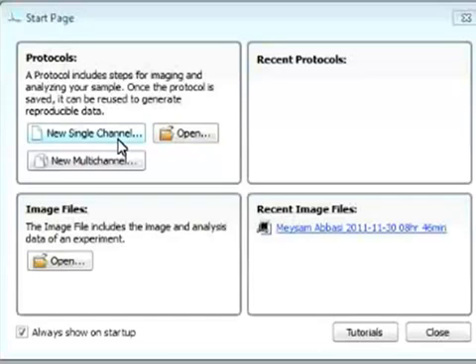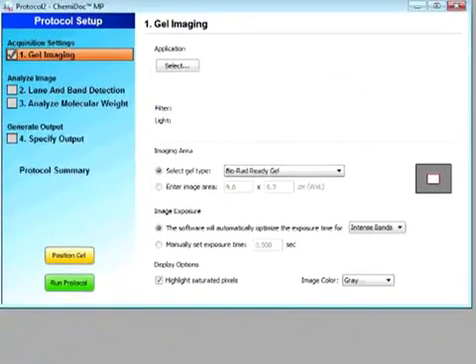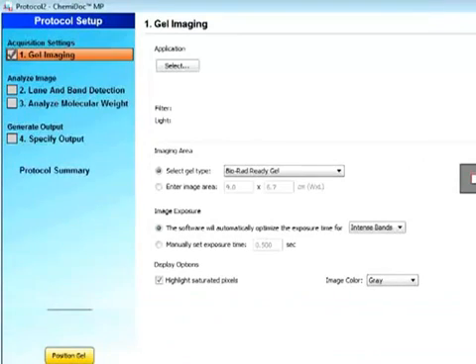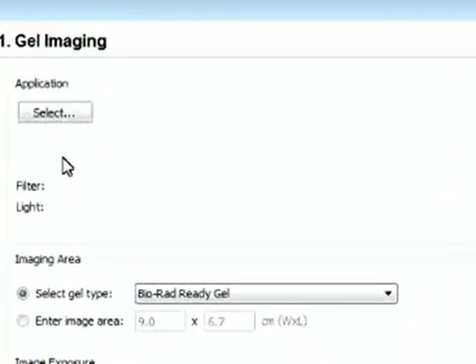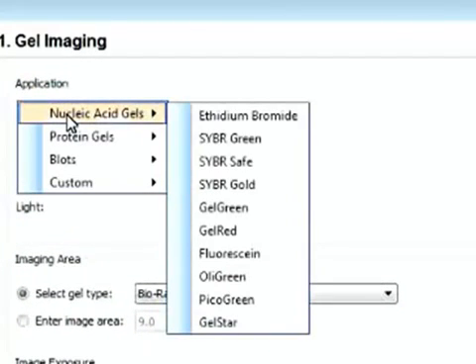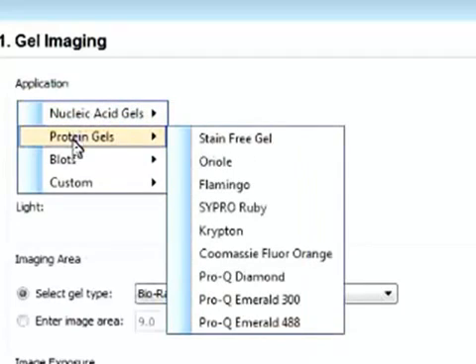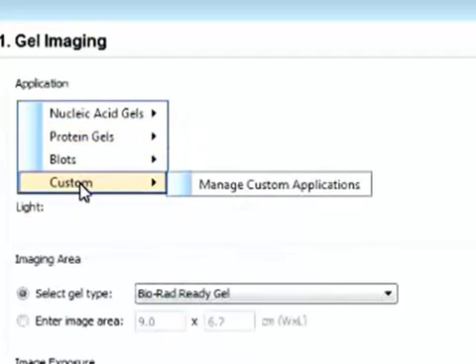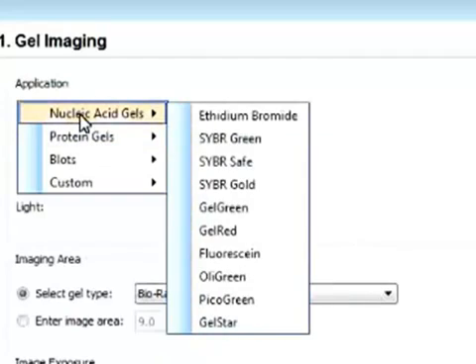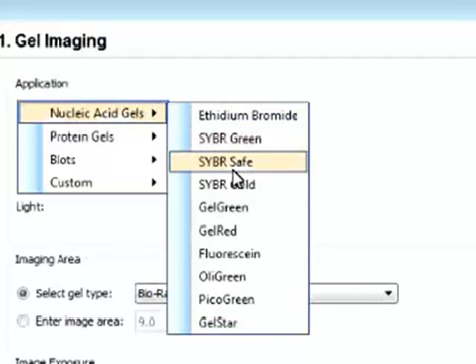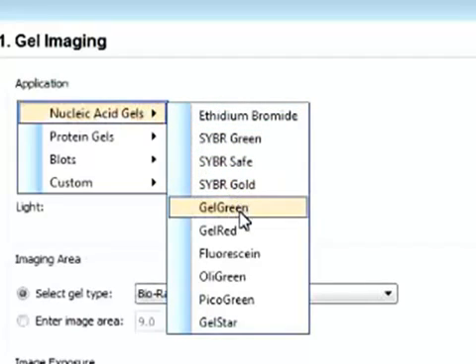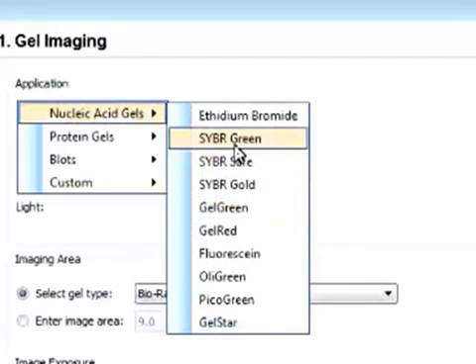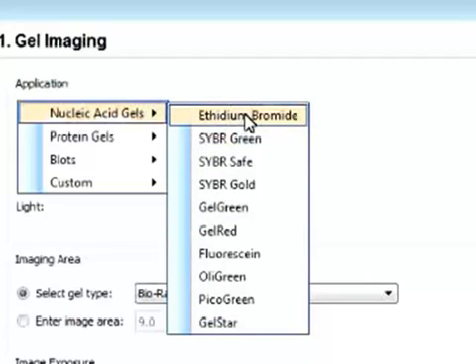So say if you want to start by looking at a new single channel protocol. And a nice feature about this software and the whole system is that everything is automated, so the workflow is automated. We basically select our application, whether it's a nucleic acid gel, protein gel, blots, or custom gel. We select our application, and the light source and the filter will be selected automatically. In the nucleic acid gels, we have all these dyes that are preset into the protocol.